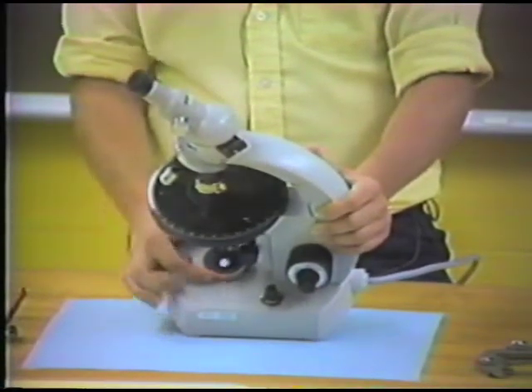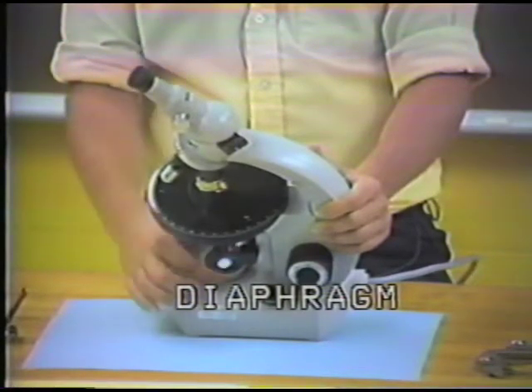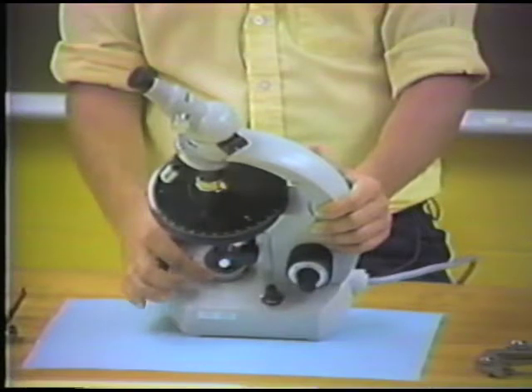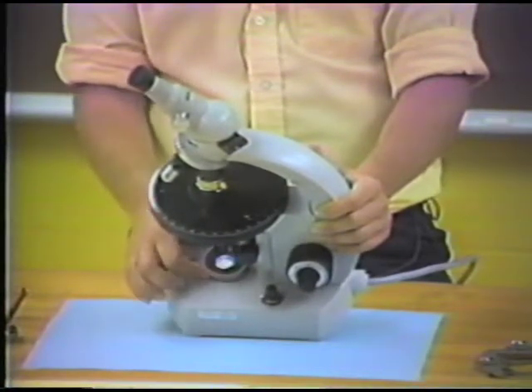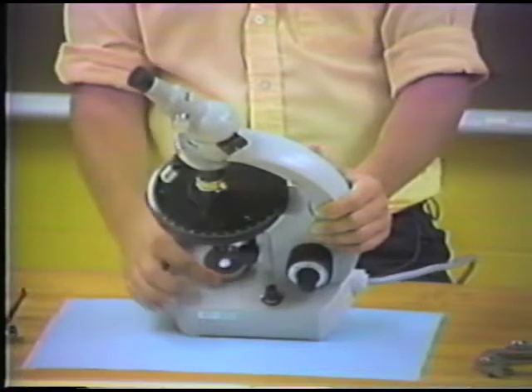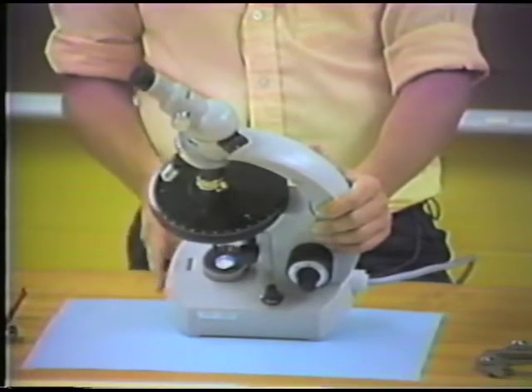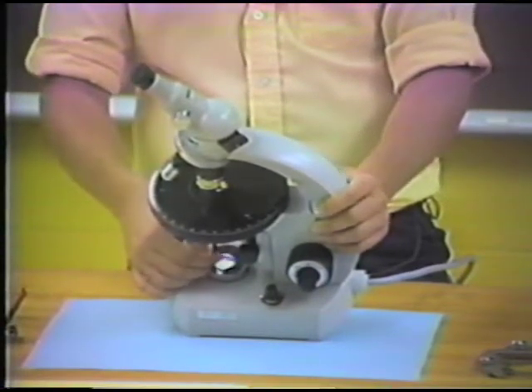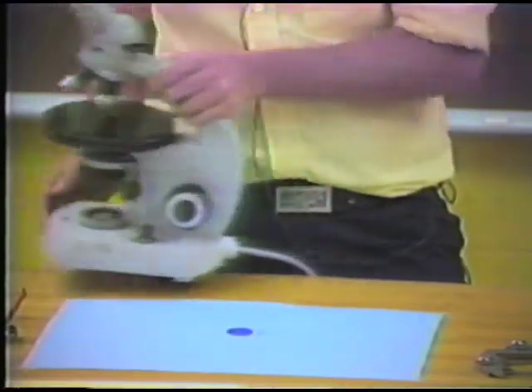Now, every light has a diaphragm, and you can see changing the size of the diaphragm here, which controls how divergent the light is coming from the source. This is an important variable that you'll want to change. There are other diaphragms elsewhere in the microscope, but there's typically one associated with the source of the light itself.